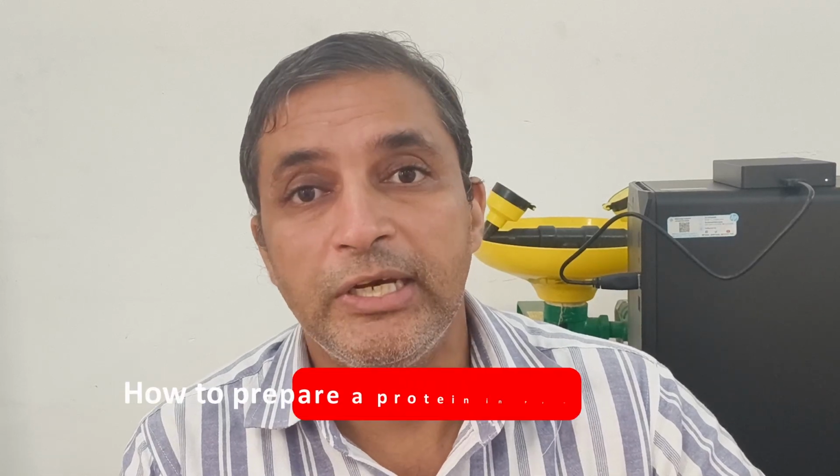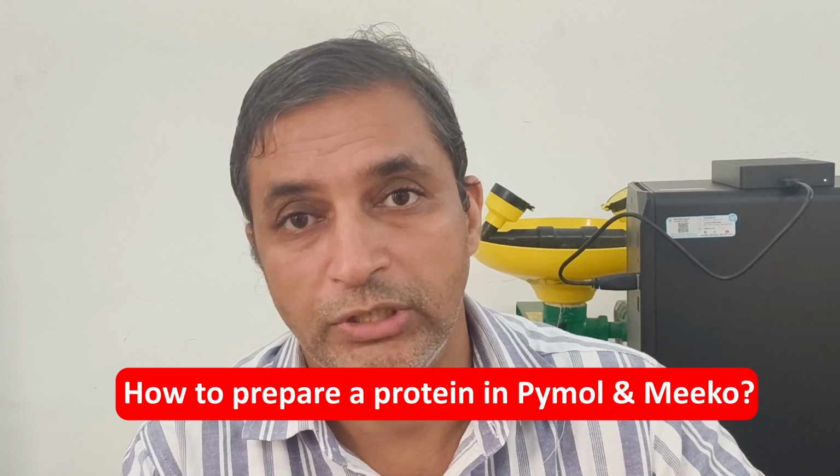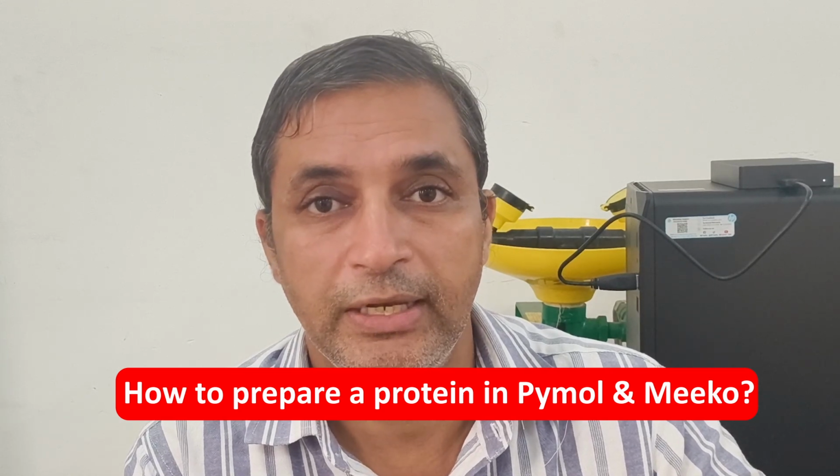So in today's video, we are going to learn how to prepare a protein in PyMOL and Meeko so that it can be used for the subsequent docking process. So without any further delay, let's start today's video.